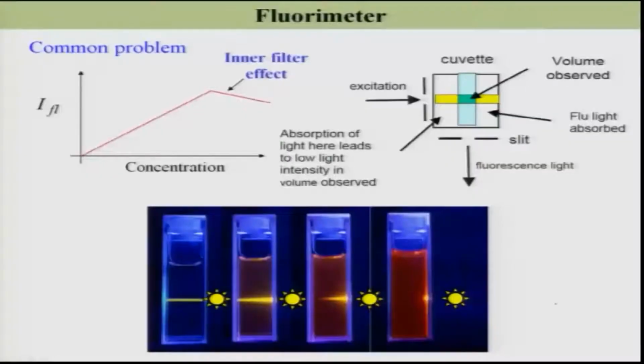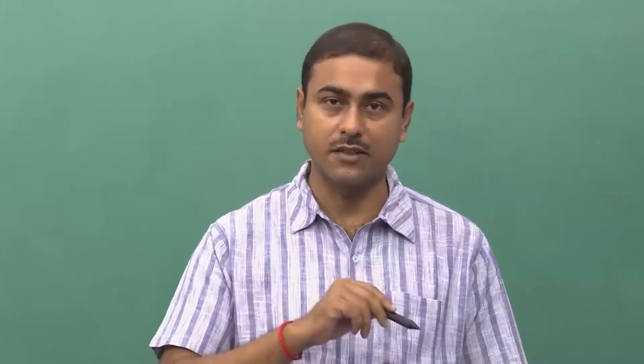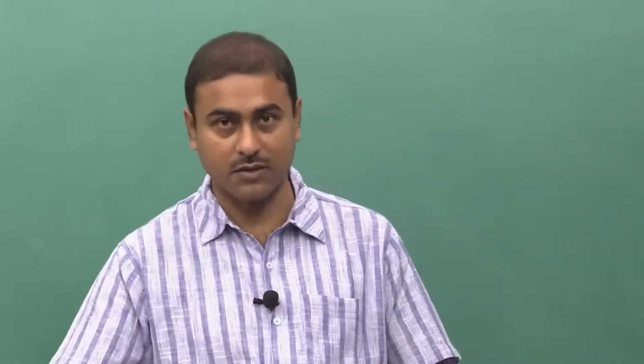Nevertheless, as I said earlier, when you increase the intensity of excitation, your fluorescence intensity will increase. When you increase the concentration, your fluorescence intensity will also increase.